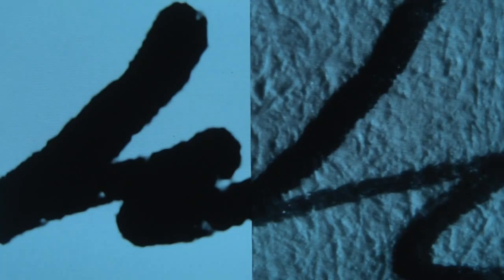These tests start by looking at the ink on a document through a microscope to study its color and general appearance, which may give a clue as to the type of pen used.